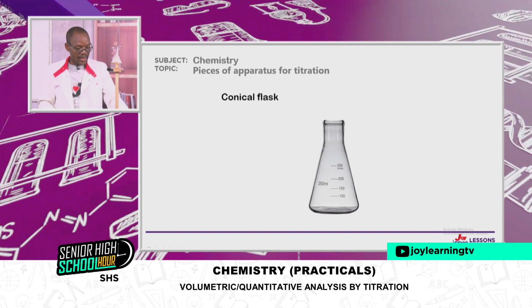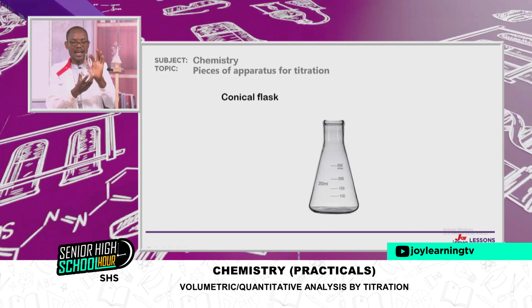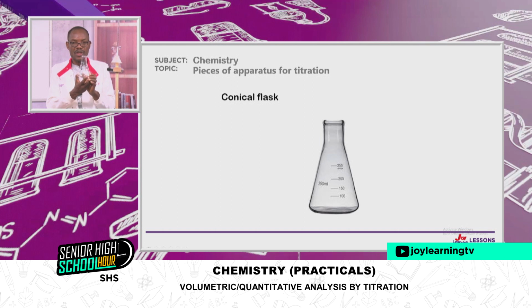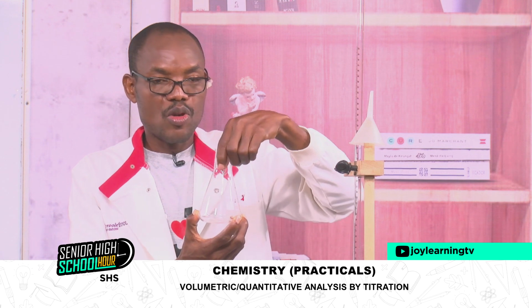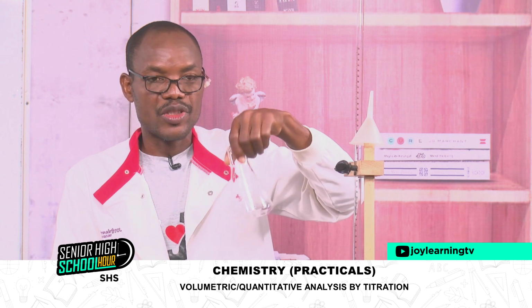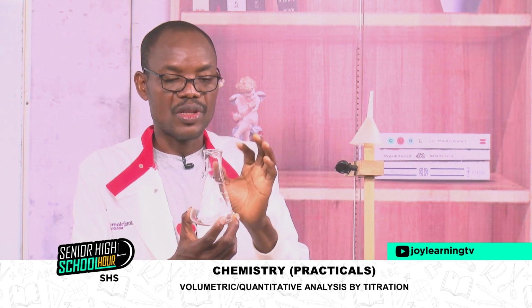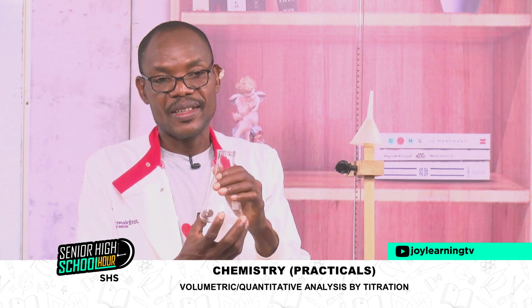Next on our list is the conical flask. You can see how it is designed in the form of a cone, and it is specially designed for its purpose, so that when we are using it in volumetric analysis, you hold the top of it like this and you swirl whilst you are running the titration. Also, if you are boiling something in it, it will not easily evaporate, so that you lose whatever is in it quickly.